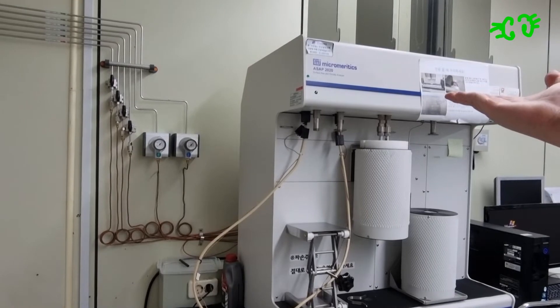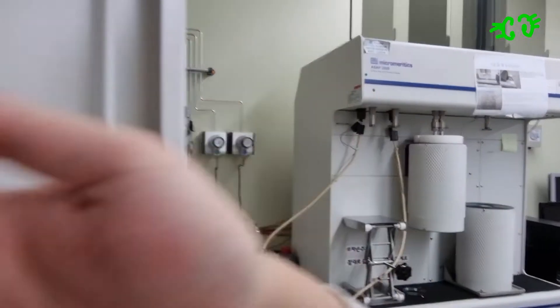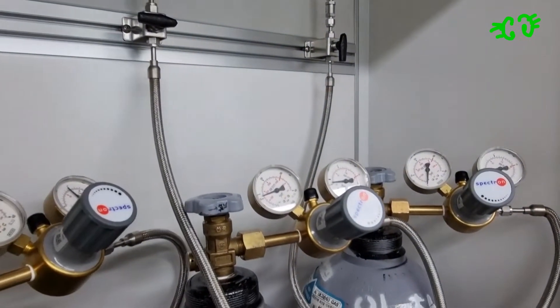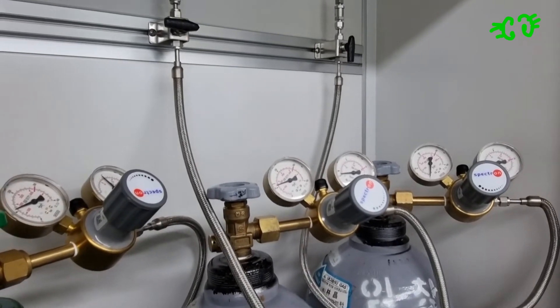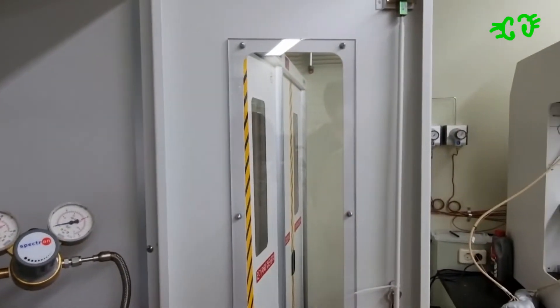If you want to use the surface area and porosity analyzer, you need pure nitrogen gas. I'll be showing you how to open the nitrogen supply to the machine so that you can use it.